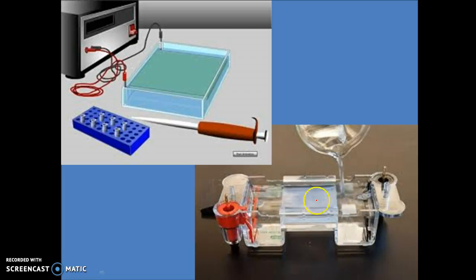You are going to put your gel in the gel box, cover it with buffer, so that your wells are here. So all your proteins are lined up on this side. I don't know if you've ever had to help a parent jump a car or messed around with wires for any reason at all. But you may already know that in electrodes, black is always negative and red is always positive. Okay? It's important to know. Life lesson if you ever have to jump a car. We are going to align our wells with the negative end. Okay? This is very important.